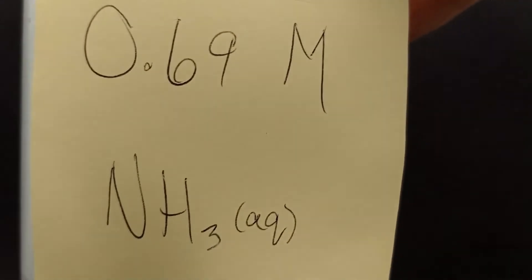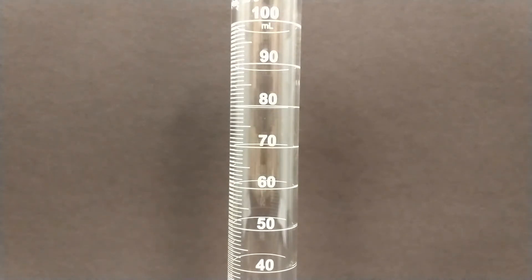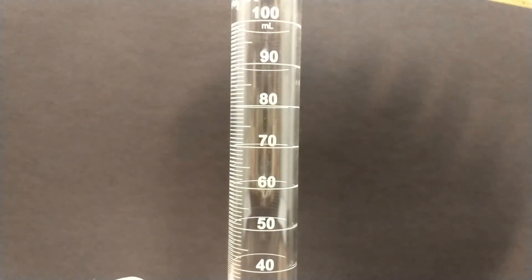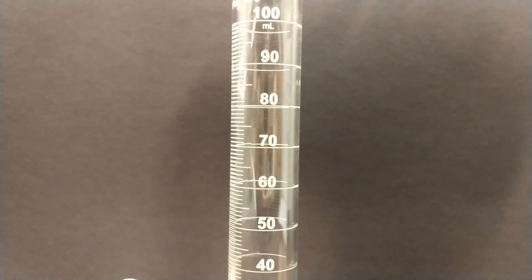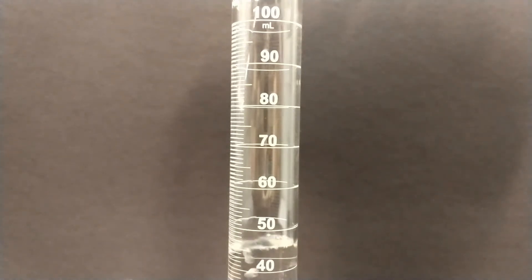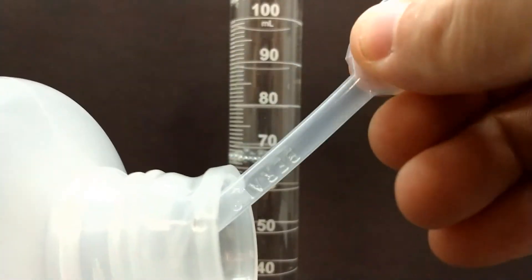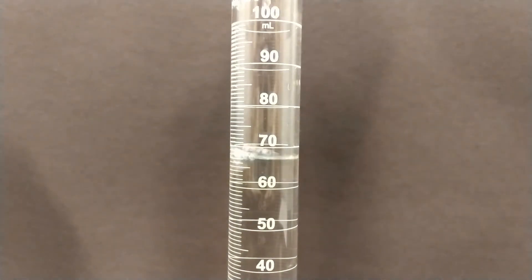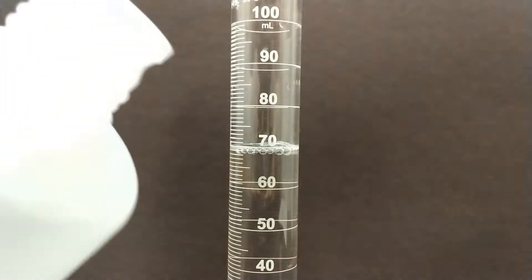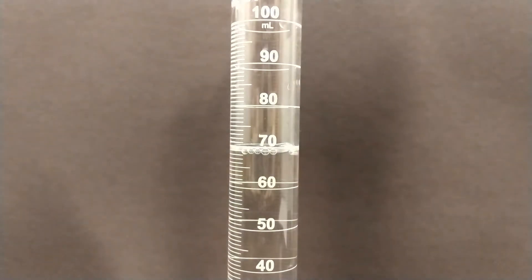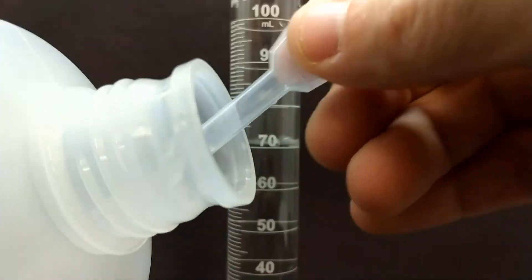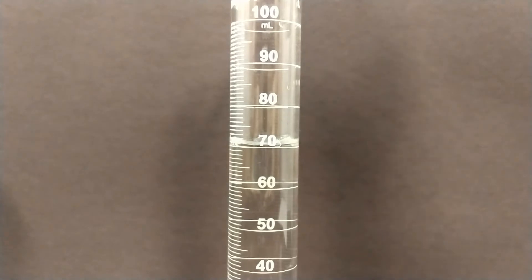The first step is to measure out 72.9 milliliters of the 0.69 molar ammonia aqueous. You want to use a clean and dry graduated cylinder and then pour it from your stock bottle into the graduated cylinder. Once you get close to your final volume, your desired volume, then you're going to want to switch over to a pipette so that you can add precisely to the volume that you need.